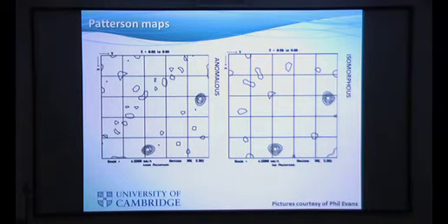But if we would have a heavy atom derivative of the same crystal, we could calculate not only intensity differences between Friedel pairs, we could see how an intensity changes between the two data sets.